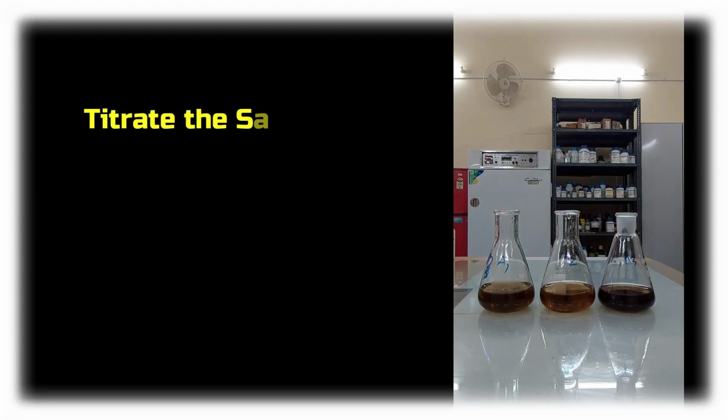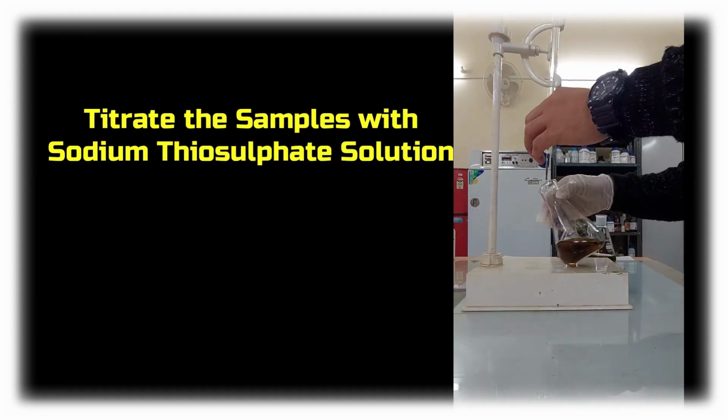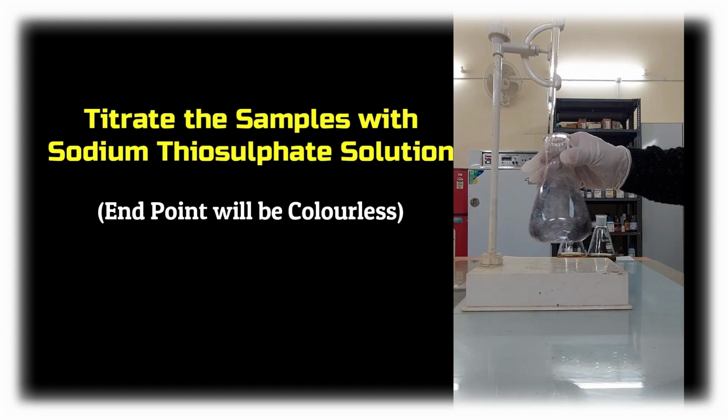Next, let us now titrate the samples with sodium thiosulfate solution. Titrate the solution till the endpoint is colorless.